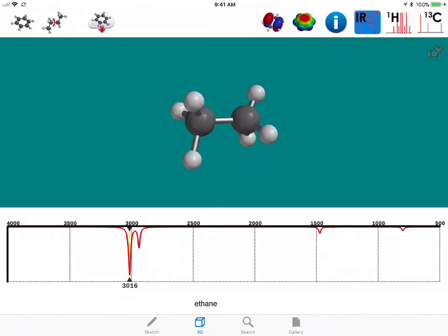In the IR spectrum of ethane, we have CC and CH sigma bonds. And in the region of about 2,900 to 3,100 reciprocal centimeters, we see the CH stretching. This simulated spectrum will show two of those in that region.